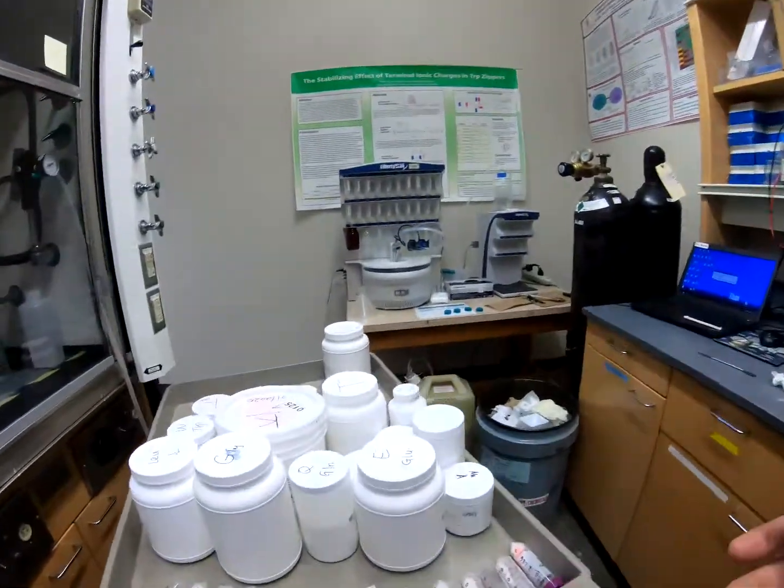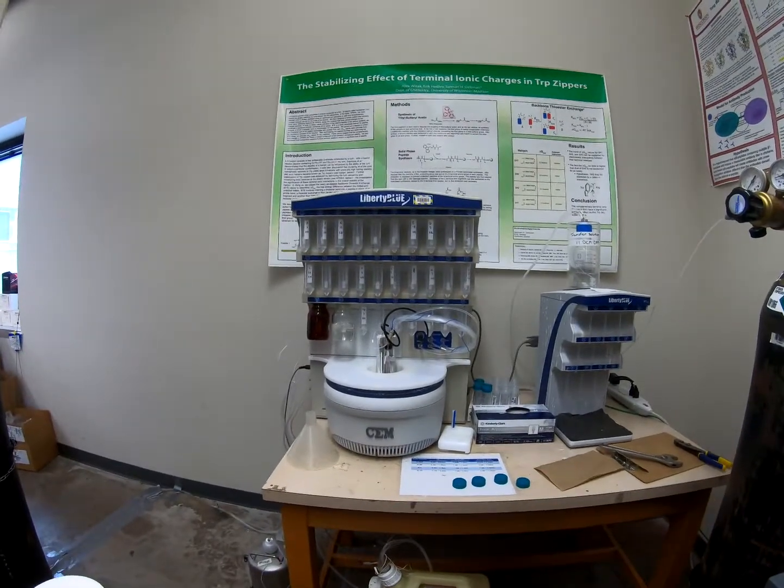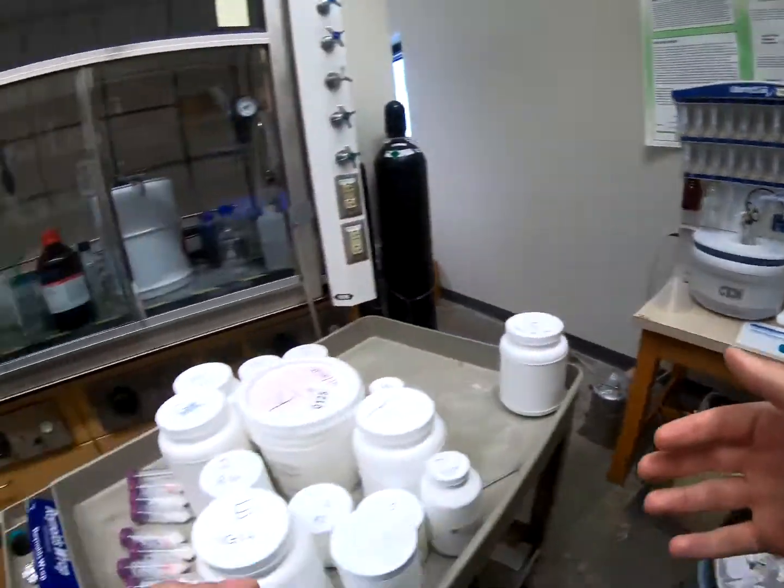In the corner over here, we have our Liberty Blue, which is an automated peptide synthesizing machine, which is very handy when you've got a longer sequence to work with.